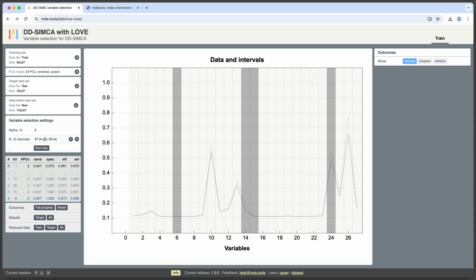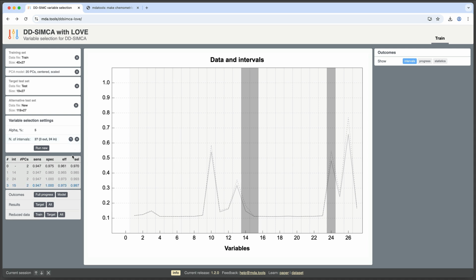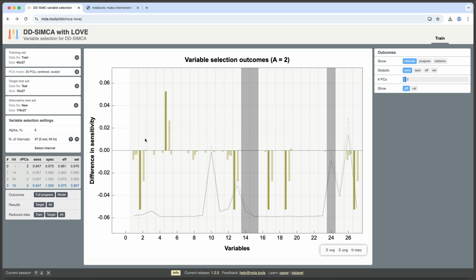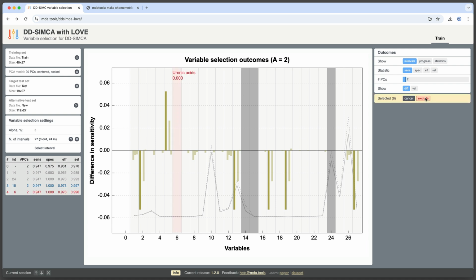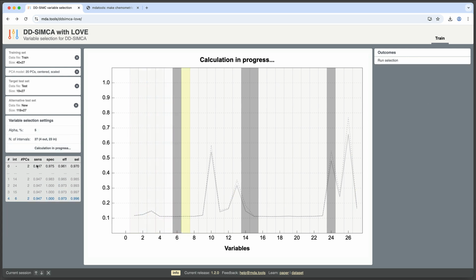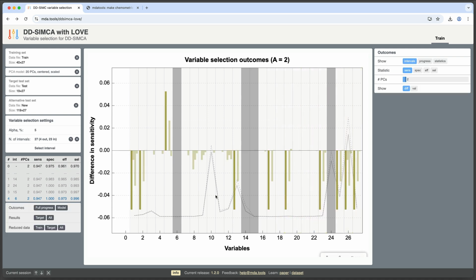Then you can see 4 out, 23 in. And by the way, if you, for example, don't like your decision, if you excluded the variable and then found out that it's not the correct choice, you can always go back. For example, you can see I go back and now 6 is back, right? So let me just remove it again. You can go back and forth and, for example, undo some of the not very nice decisions, right? So let me exclude it, run it again. So again, you can see what's going on here with the process.